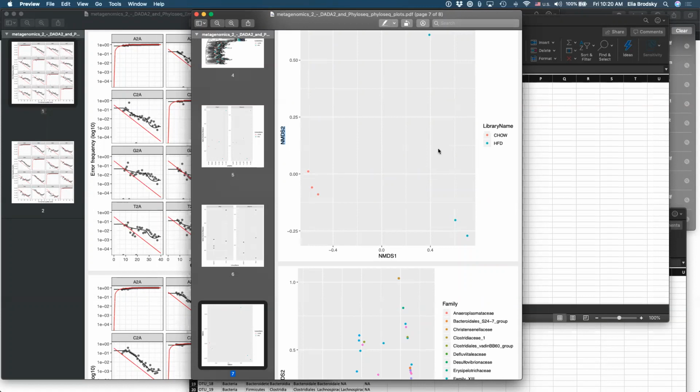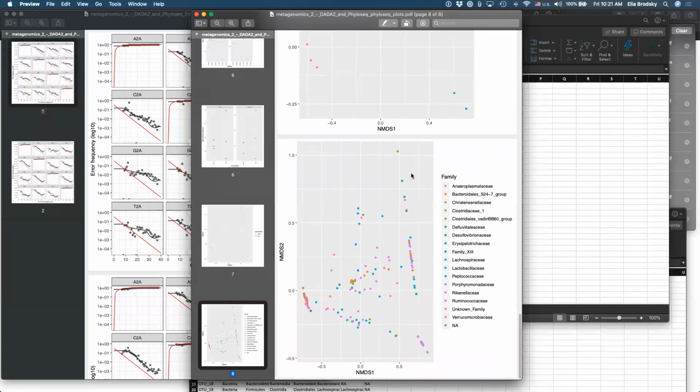You see there is a big difference, and they separate very clearly. This is something like PCA, a dimensionality reduction technique to reduce the number of information points in our data. We have over 300 OTUs there, and we compress them to give us variability: how are the samples different from each other based on the abundance information?